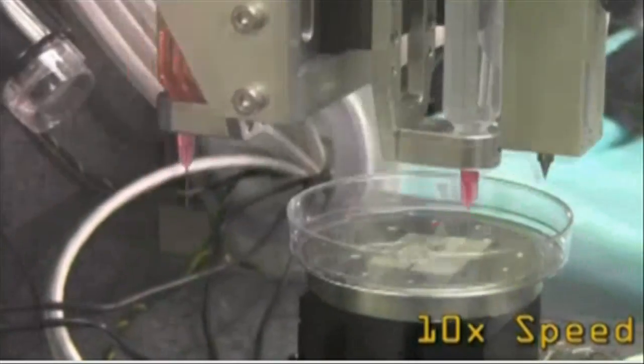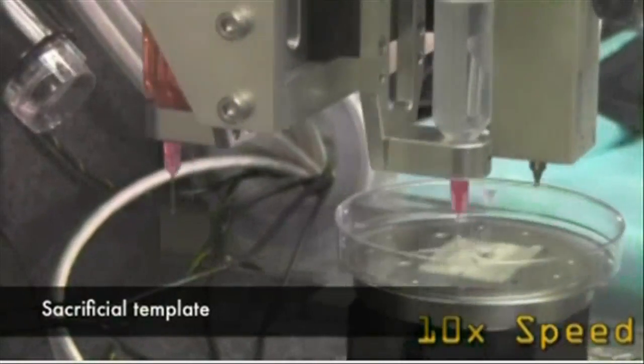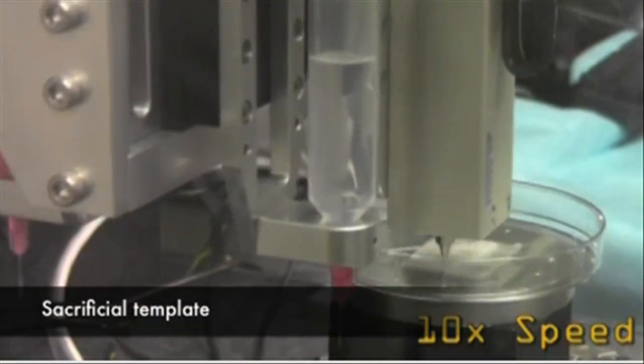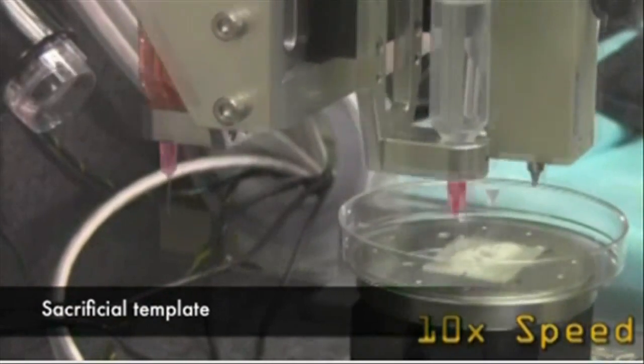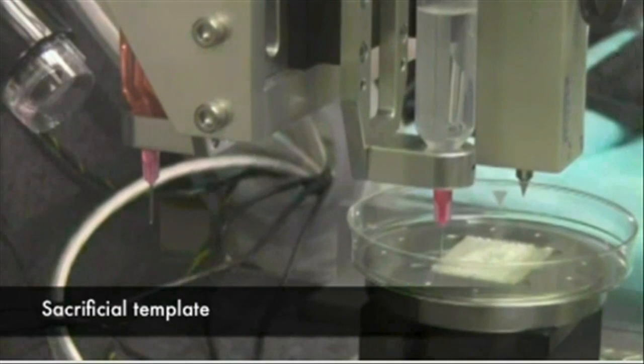Tissue engineering is a science that aims to grow replacement tissues and organs in the laboratory to help solve the shortage of donated tissue available for transplants.